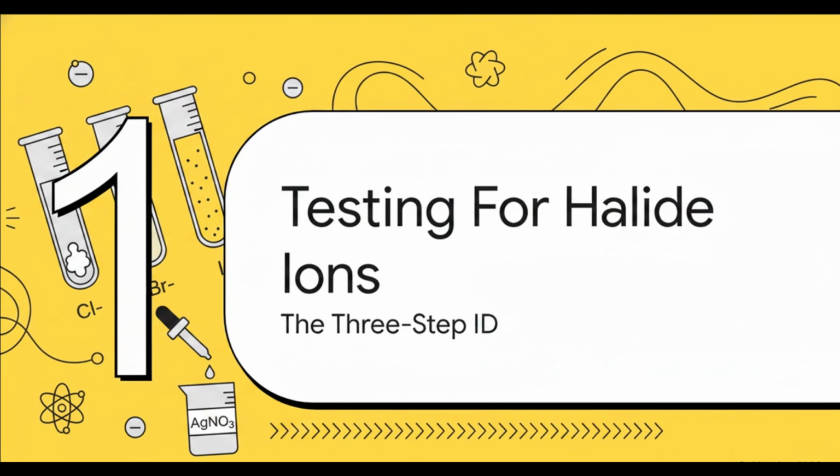Right, first up on our list, the halides. We're talking chloride, bromide, and iodide ions. Identifying these involves a really clever multi-step process. It might look like a bit much at first, but you'll see there's a perfect logic to it, where each step builds on the last to give us a solid, definite answer.